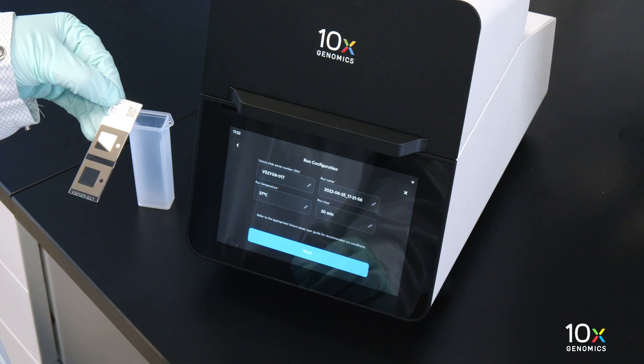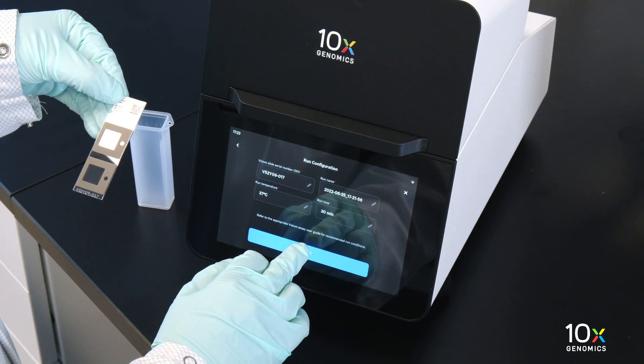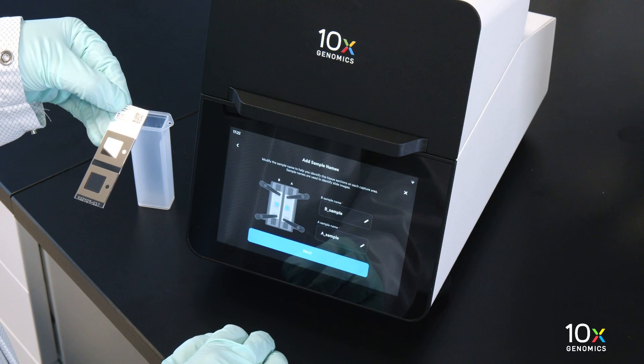Enter the custom run name, temperature, and time. 37 degrees Celsius for 30 minutes is recommended for most applications.